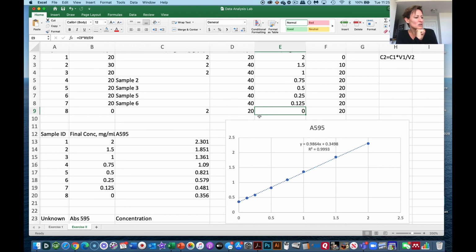And then it's just asking you to think about, let's assume that something you could do with that value is to subtract it off of every single absorbance value. So I want you guys to think about how, if at all, it would change your plot, how, if at all, it would change your equation, change your r² value. Okay, so I'm going to leave those up for you guys to think about, but that's creating and using a standard curve.